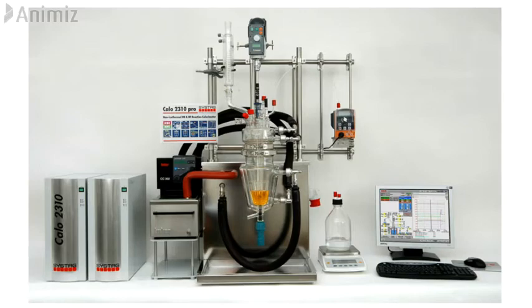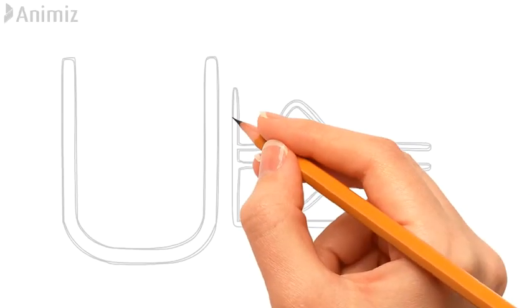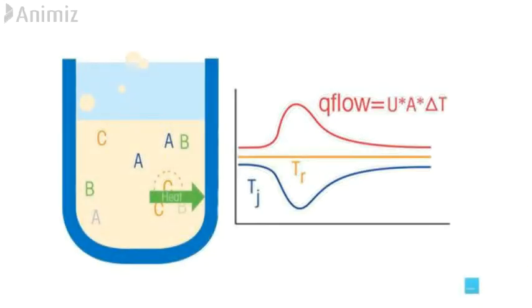For a given experiment, the optimal type and design of reaction calorimetry depend on details of the experiment and the process being measured. Hence, the majority of literature on reaction calorimetry is specific to the type of process. This video will detail the characteristics that must be taken into consideration when evaluating the performance characteristics of reaction calorimetry. The performance of reaction calorimetry depends upon design characteristics like pressure range, stirring capacity, reactor volume size, and heating and cooling rate. Although the most important characteristics are the measuring principle and the temperature control method.